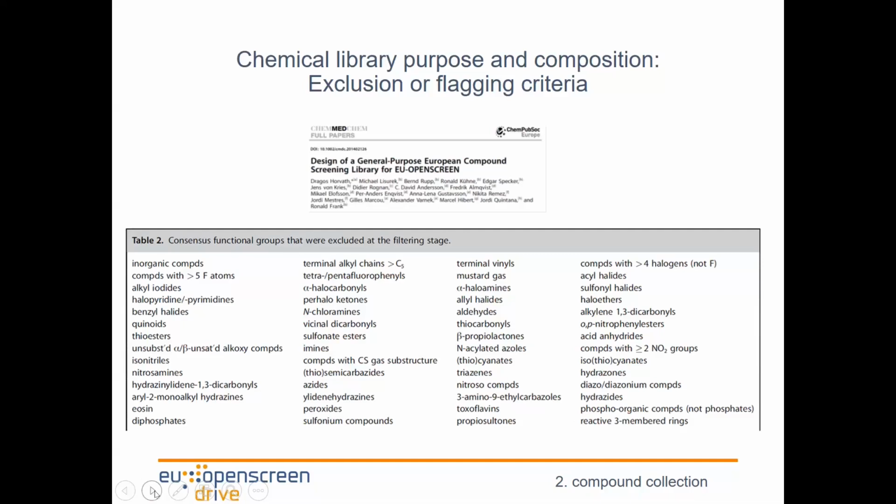You should not discard them if you are looking for chemical probes, but you should be aware of those compounds, having some kind of warning or a flag of this compound that if it is a hit, you could think, okay, maybe this could be due to these chemical properties. Of course, there are some other compounds that make no sense to be included because they are toxic for almost everything. But you have to select quite strictly the compounds you are going to include in your chemical library.